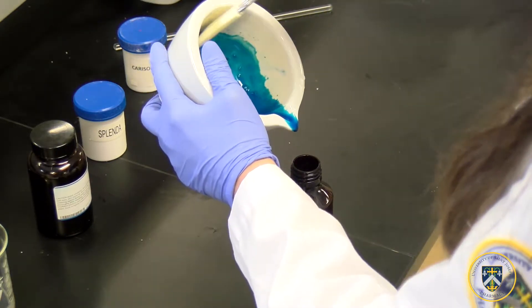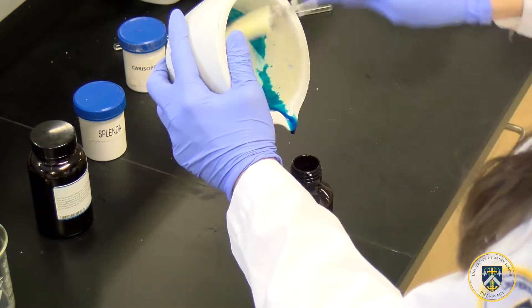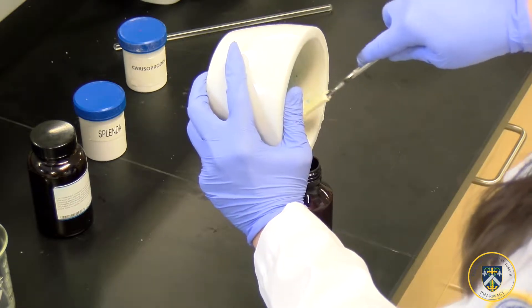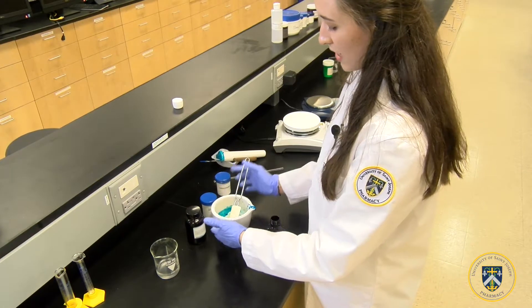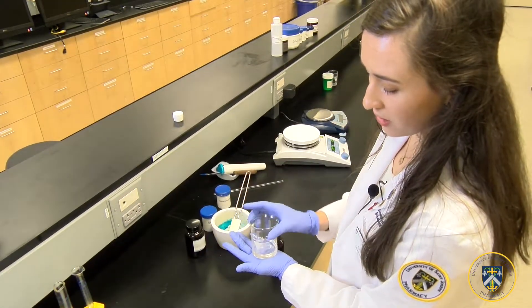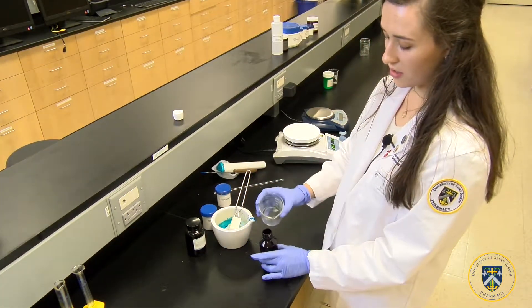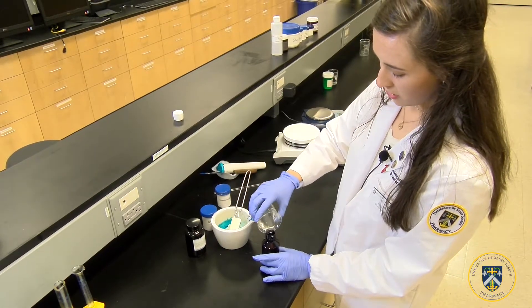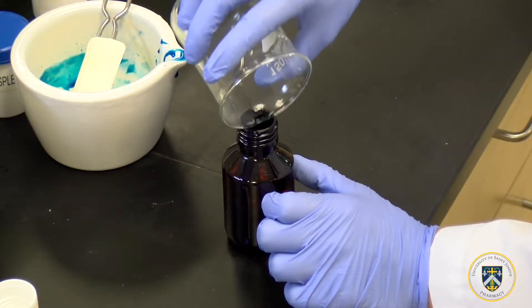Take out the excess. Make sure we do get the 40 mls of the suspension, and once we have the 40 mls we will add the remaining 20 mls of the methyl cellulose gel to make up the difference and to get 60 mls of the carisoprodol suspension.